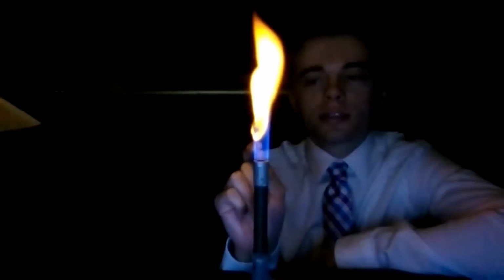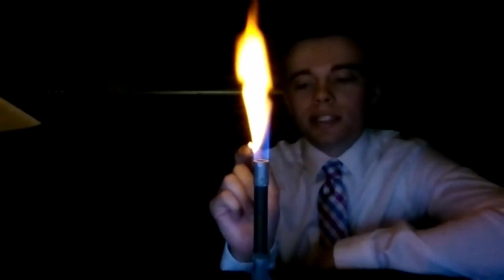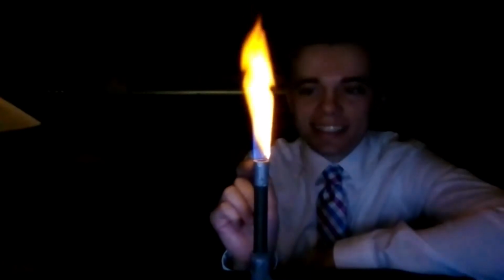That one looks more powerful than the others. Looks like it's bigger almost. It is, I think. I think I put a lot of sodium on this one. Oh, okay. It's all bubbling up.